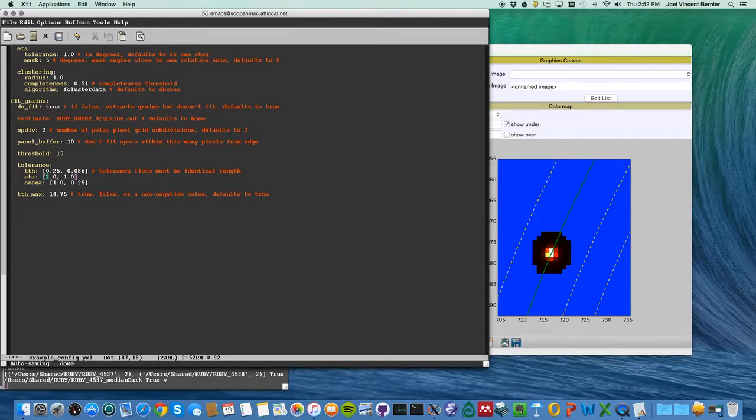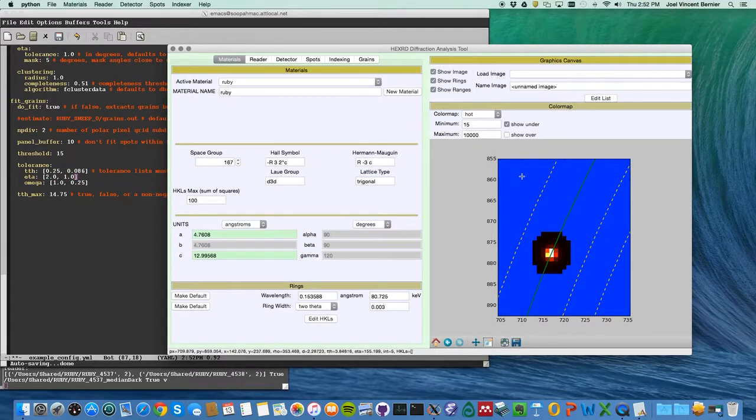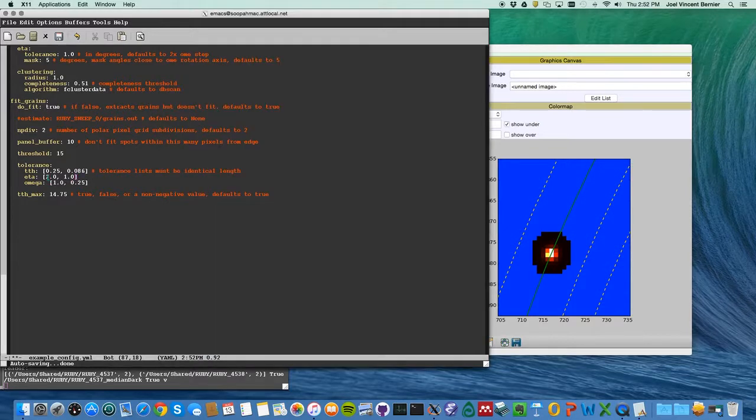And for eta, you can step through individual frames if you'd like here, but usually 2 theta and eta are relatively equivalent in terms of what these tolerances should be. So remember, this is total range, width of the window, and this is plus or minus number of, it's a plus or minus tolerance, just specifically for omega. You can actually write it in the comment here.